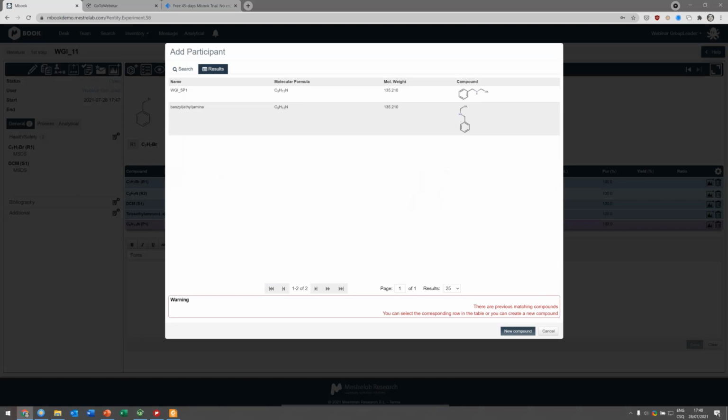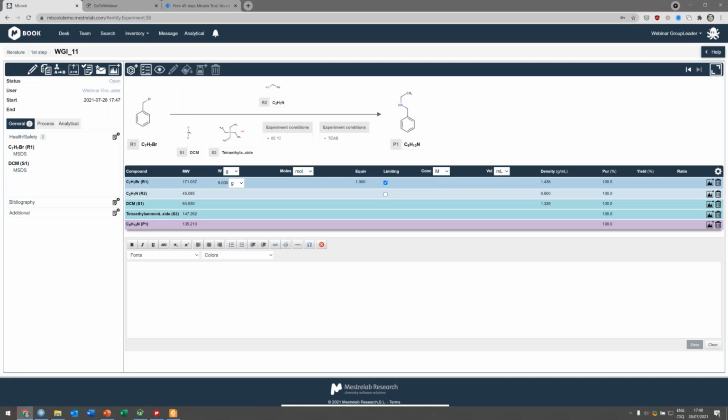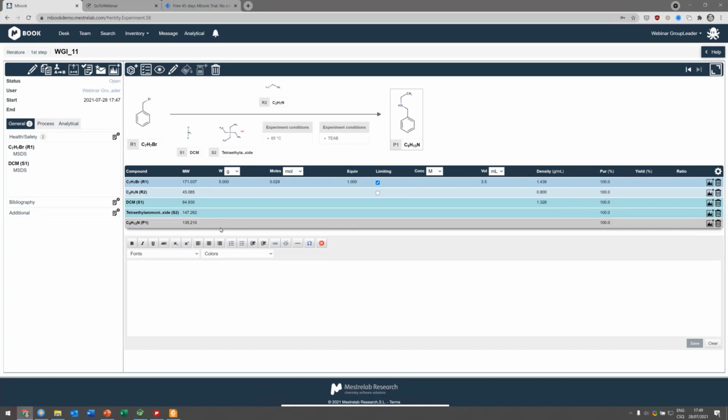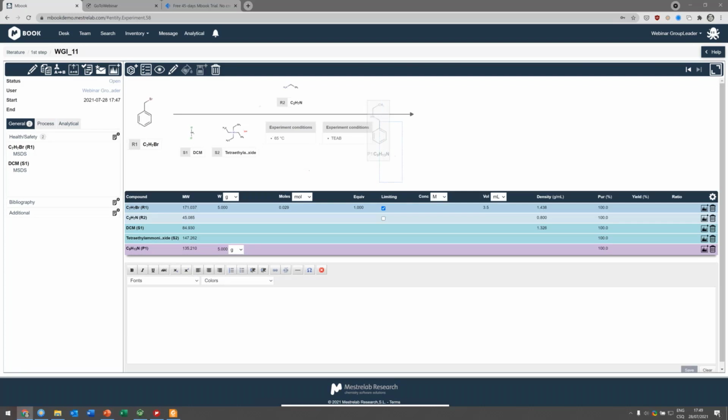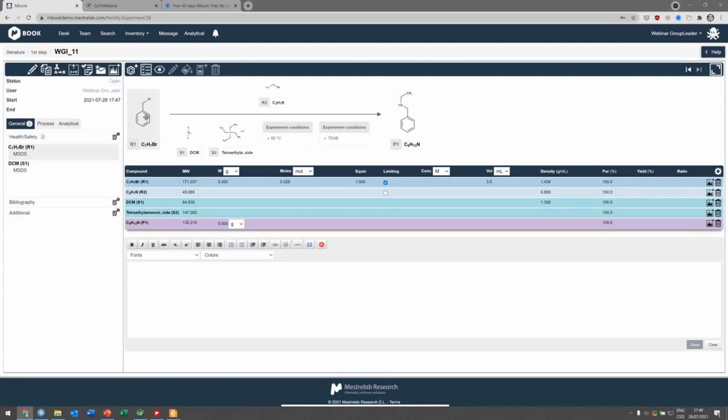Another question, sorry, I'm already reading the question. Can I add my own compounds to a stockroom or inventory, or is it just the ones you fill? So you can add your own compounds. Let's just find a suitable compound. I need to have some end result mass, and at this moment, okay, now I can do it. Sorry, I just needed to create.